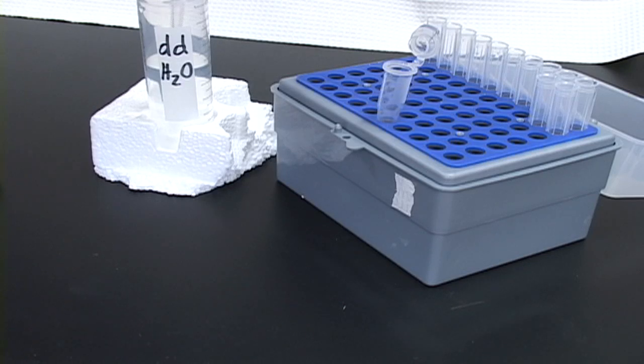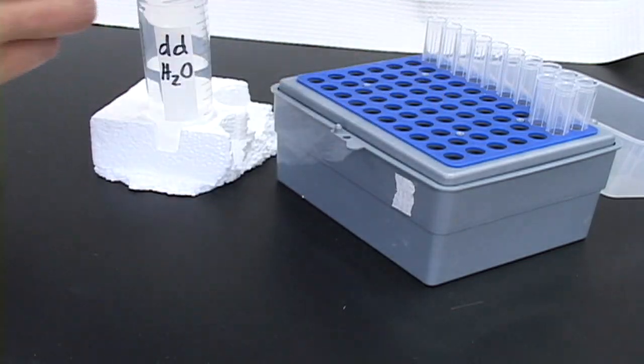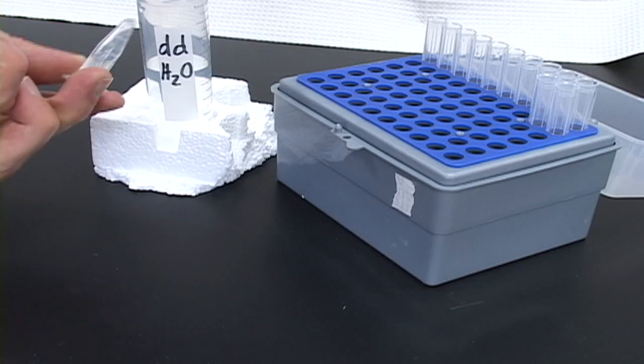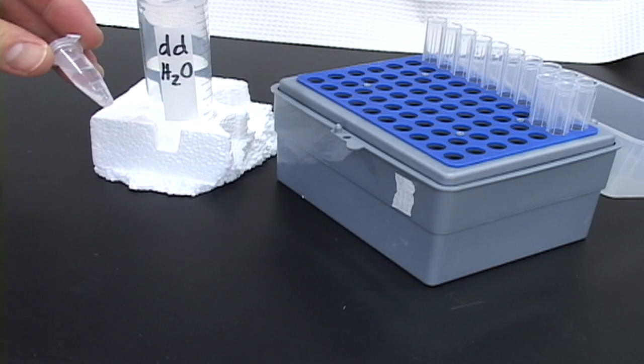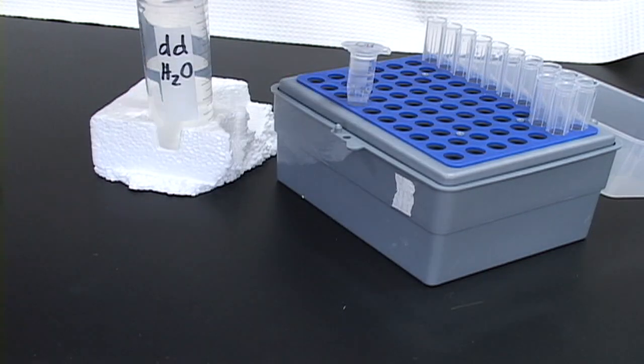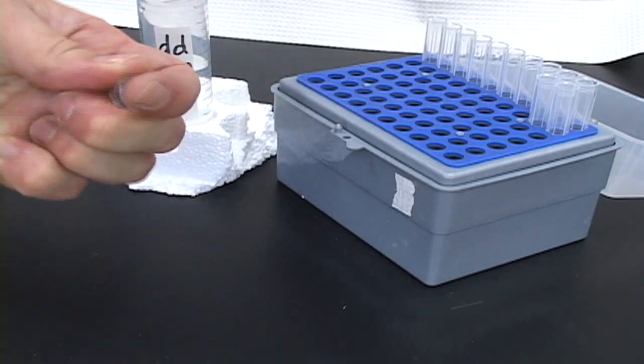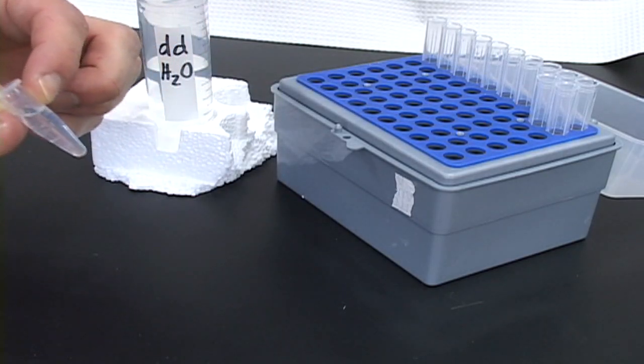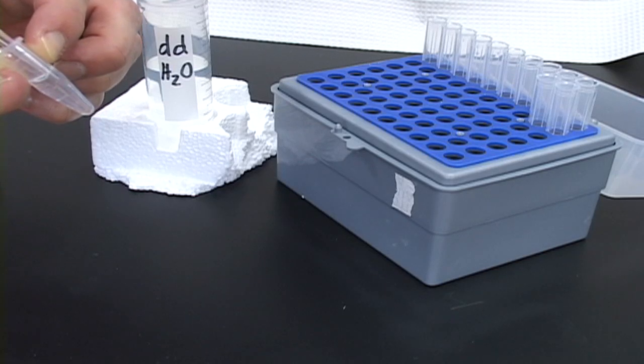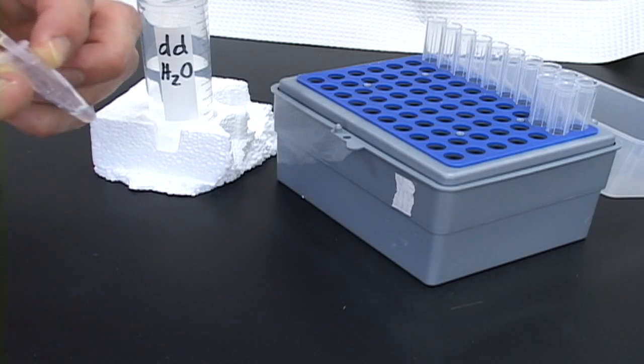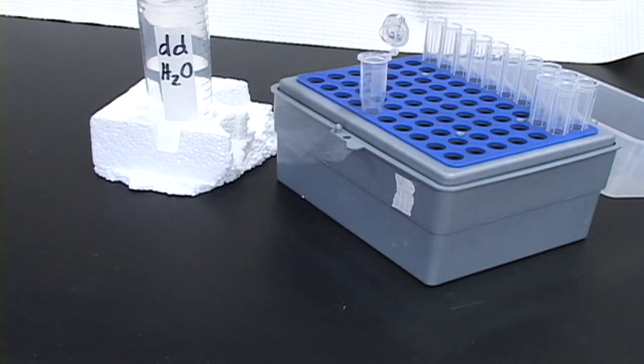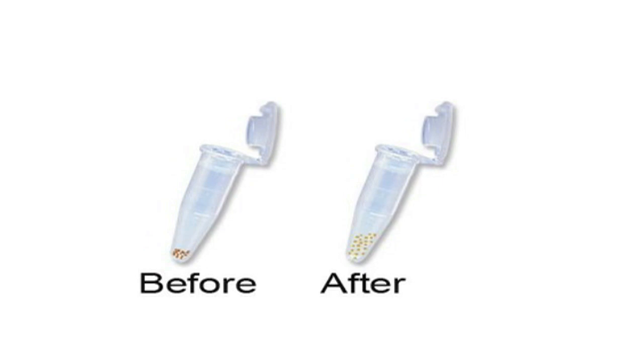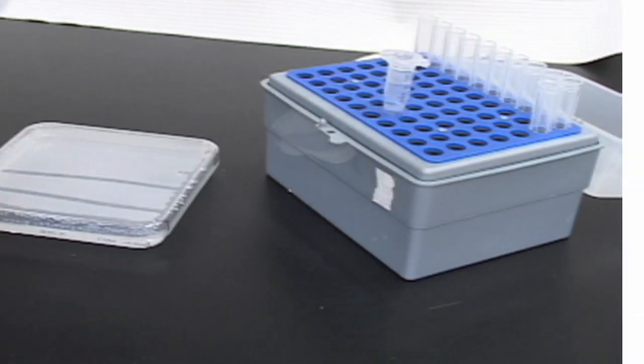Then, add 1 ml of water and invert once. After the seeds have settled in the tube, carefully draw off the water. You will notice that the seeds swell with each successive rinse, such that the volume that they take up in the tube increases. Watch the level of the seeds each time you remove the water and do not lower the tip past this point. Repeat the rinse three more times, leaving the fourth volume of water in the tube.